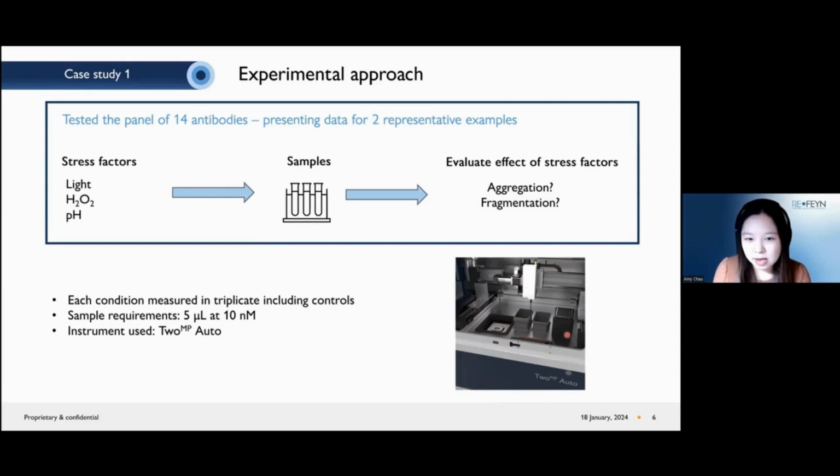There is a tray holder, so the samples are aliquoted in a 96 well plate. The users can design experimental protocols with number of repeats and any dilutions that are necessary. The robot, in this case, performs all of the dilutions in the well plate and takes about 5 microliters of samples to our measurement stage. And the researcher only needs to assemble and change out the glass slide in between protocol runs.